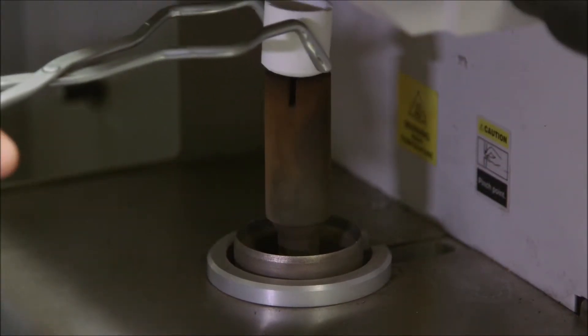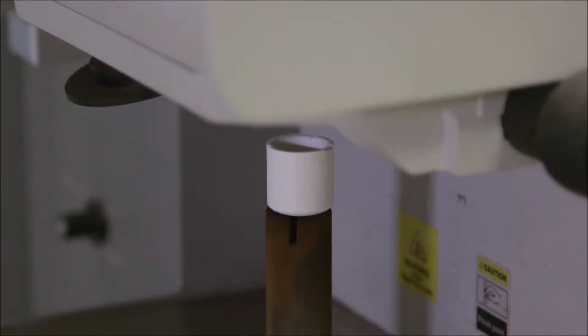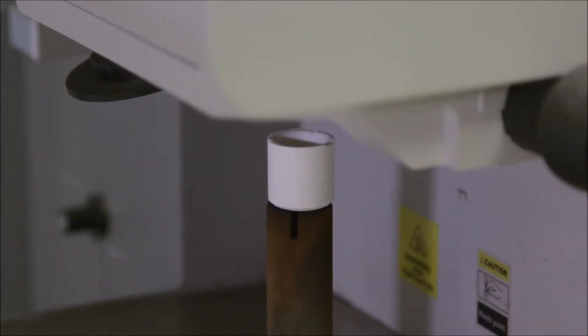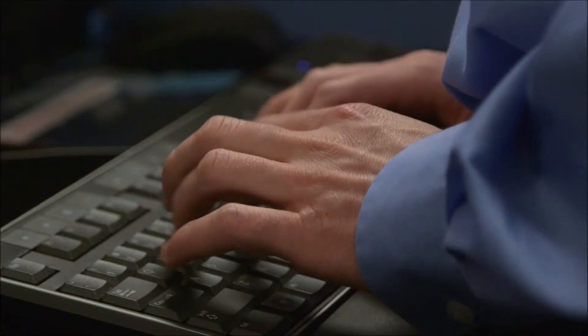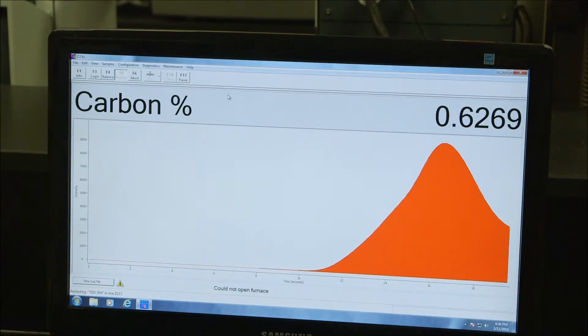Our spectrometer doesn't have the capability of getting down to the precision on these certain elements, so these two tools are used for identifying with very high precision what the amount of carbon is within a material or what our nitrogen is within our material.